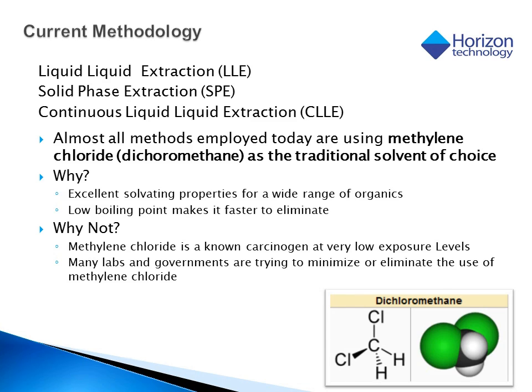However, methylene chloride is a known carcinogen, and many government and safety authorities are starting to limit its use. So a need has existed in the analytical community for solvents and methods that extract as efficiently as DCM does, however with more safety for the lab workers and our environment.